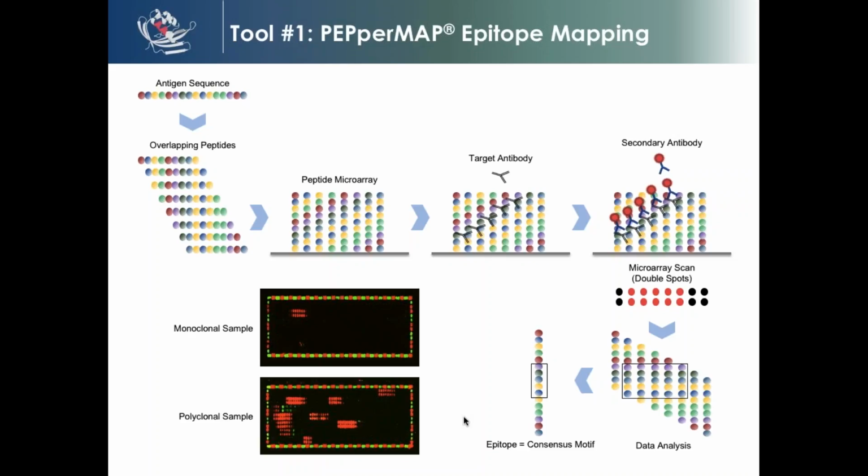Available for download. And perhaps the last question that I'm going to ask is, what is the maximum number of amino acid residues that you could make? So meaning, I think the participant is interested how many amino acids we can bind together on the peptide array.